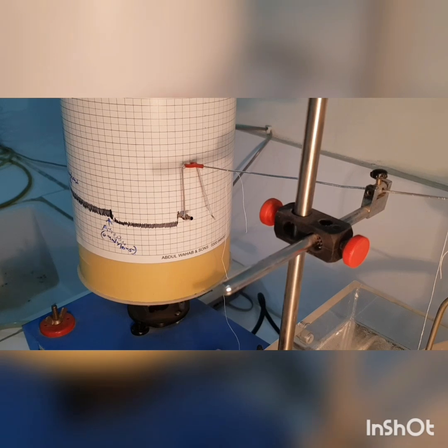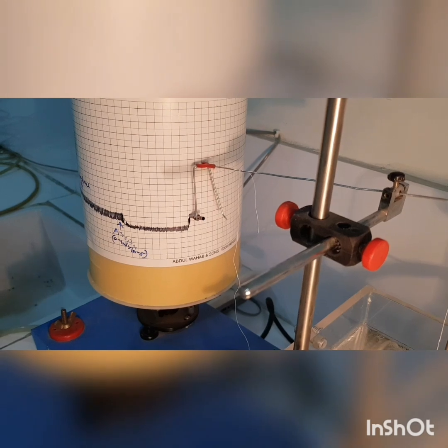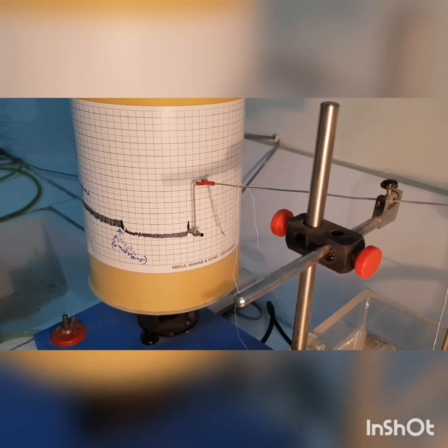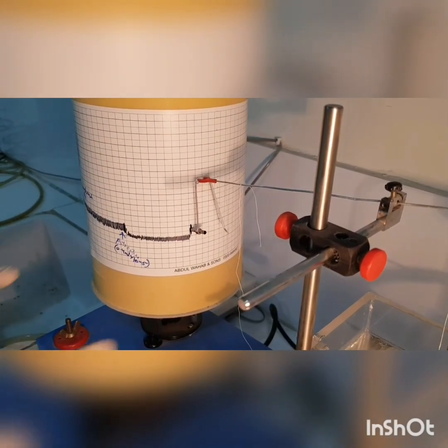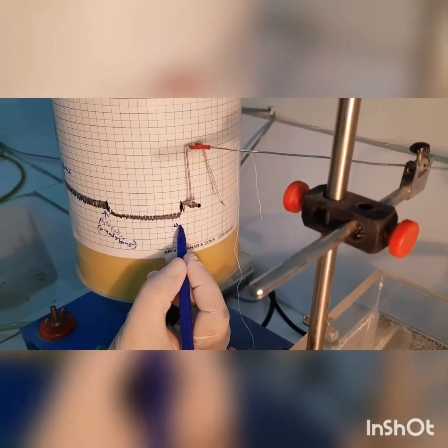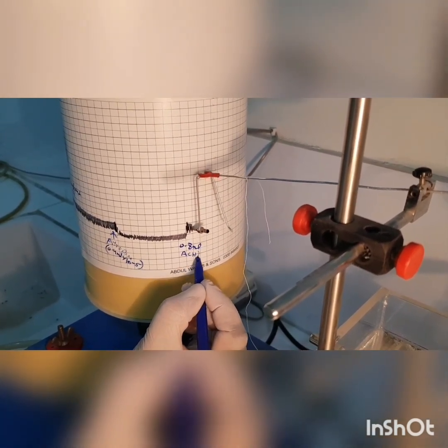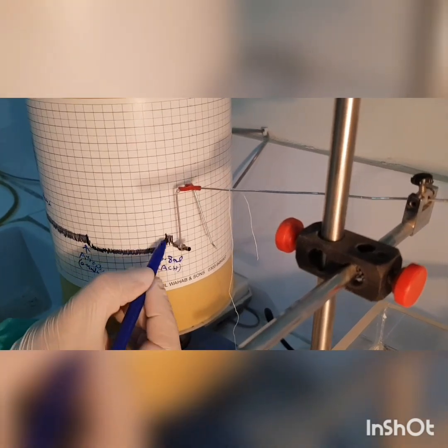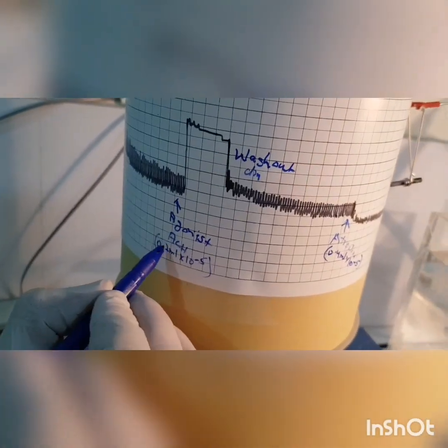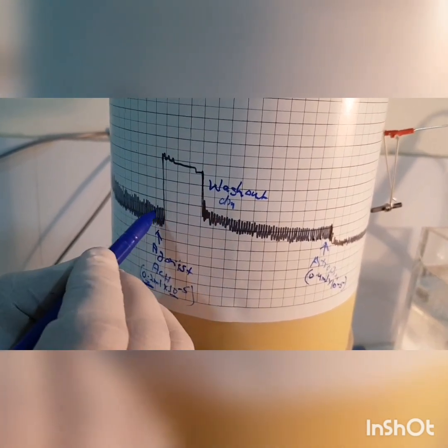Here the agonist, which is acetylcholine, shows some effect in the presence of antagonist, but this effect is less as compared to the first one, and the dose of this agonist acetylcholine is 0.8 ml, and it shows less contraction as compared to the first one, which is 0.2 ml into 10 raised to power minus 5.